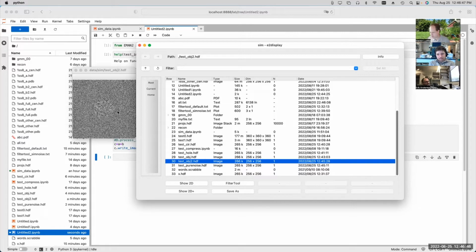So this is where you start going down the rabbit hole and saying, if I really want to simulate this right, now I really have to sort of simulate the entire process of the microscope. I've got my really simple CTF simulation. I should use a better CTF simulation. I should simulate the whole imaging process of the microscope or something like that. And you can make this process infinitely complicated. I would say for purposes of detecting an object in space, that's probably good enough. And if you say that object is too weak to detect, the extra contrast that we've added isn't enough, well, make it a little bit stronger, something like that.